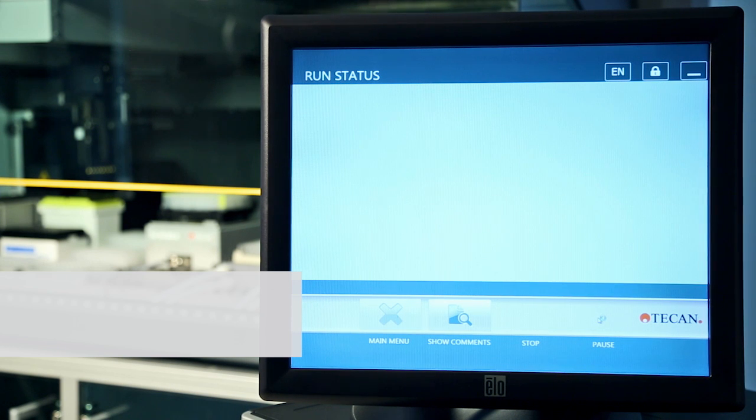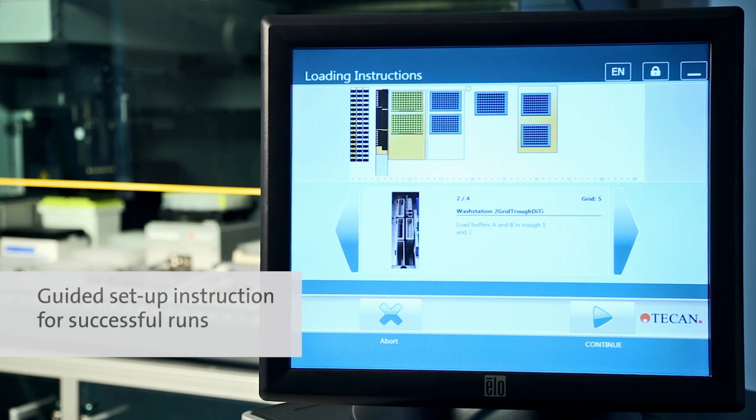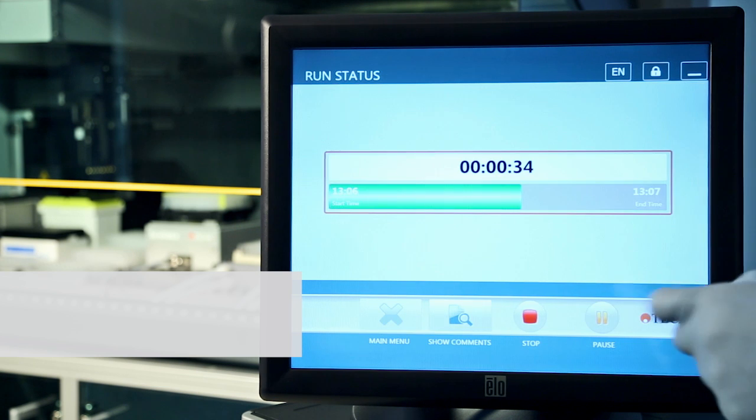The software interface provides step-by-step user guidance for experimental setup, maximizing efficiency and minimizing the risk of runtime errors.